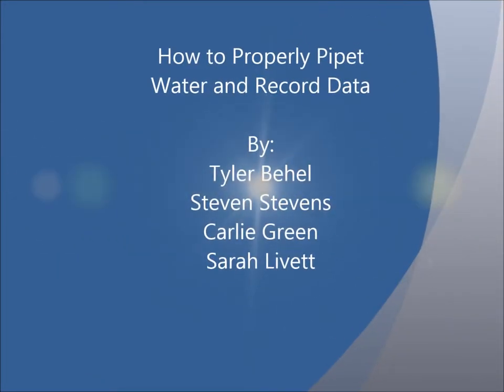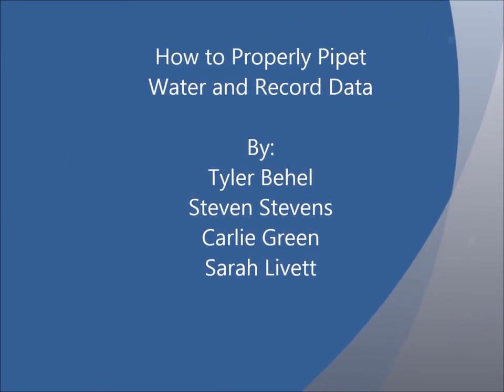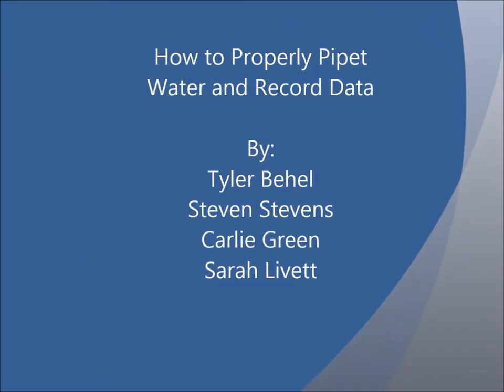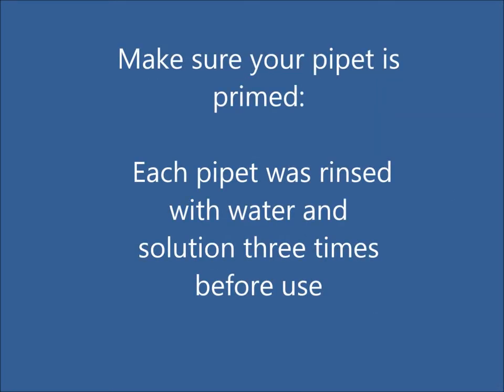Today we will be demonstrating how to properly pipette and record your data for the volume of a substance, which in this case is water. Before you begin this experiment, you should always make sure that your pipette is properly cleaned.